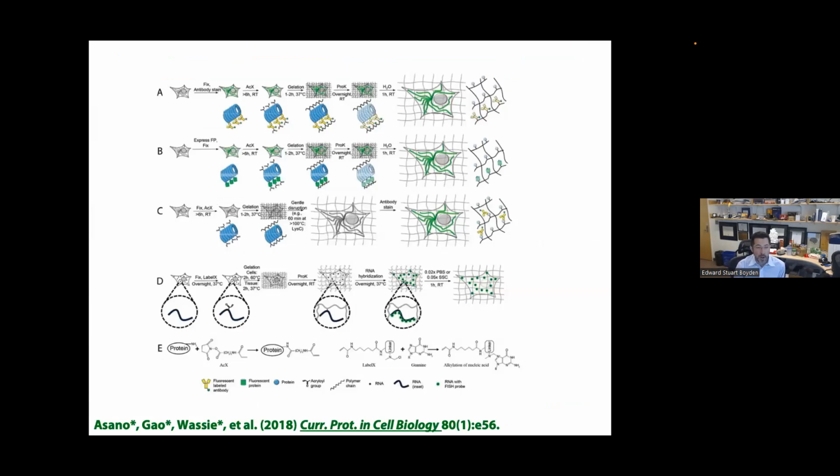We've published the protocols for the most popular methods. So there's step-by-step protocols. It's a very easy to perform procedure and very inexpensive as well. And the process is very fast. There are forms out there that can be done in a few hours, even if you have a thin sample. Yongshin Zhao, who now is a professor at Carnegie Mellon, with some help from our group, published a rapid expansion pathology protocol that can be down to 4 hours in time. But even the classical procedures can be done in a day and a half or so.